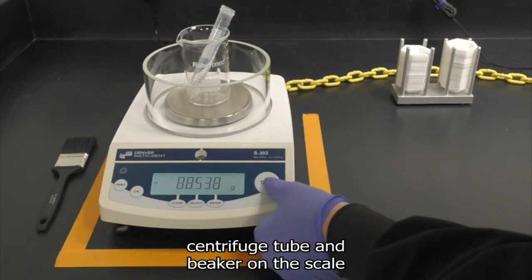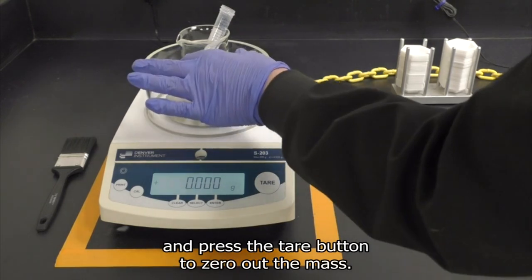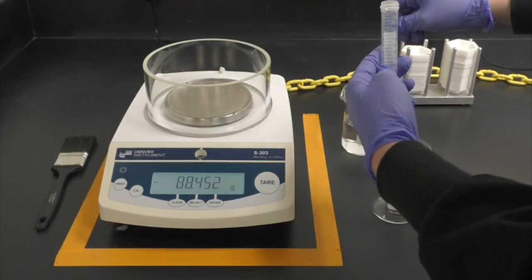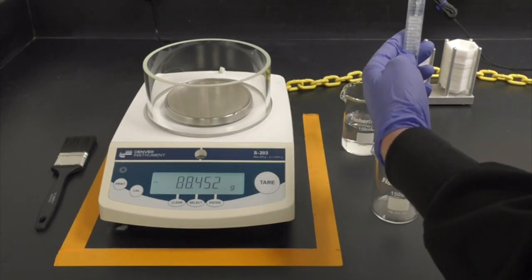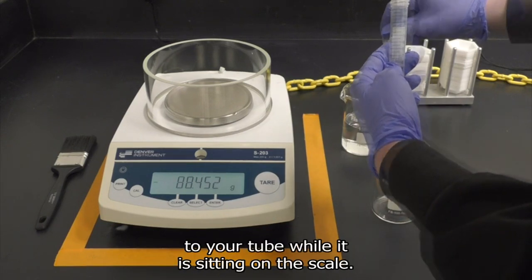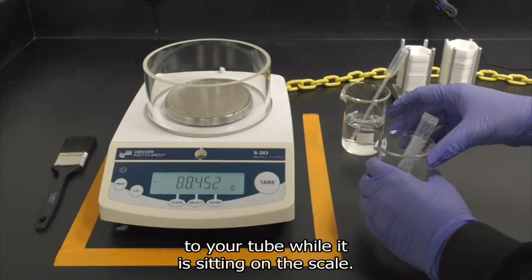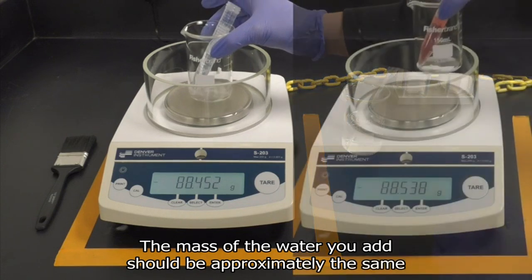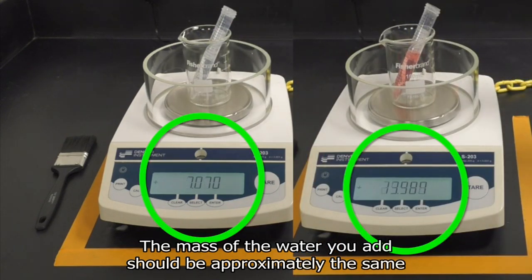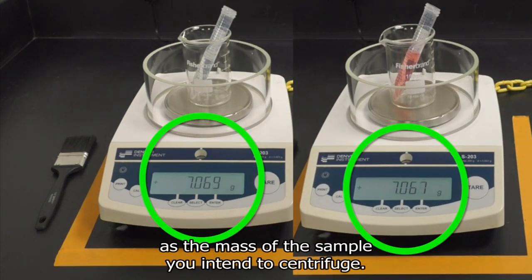To make a balance tube, you should first place an empty centrifuge tube and beaker on the scale and press the tare button to zero out the mass. Then you can start adding your liquid. You should never add liquid to your tube while it is sitting on the scale. The mass of the water you add should be approximately the same as the mass of the sample you intend to centrifuge.